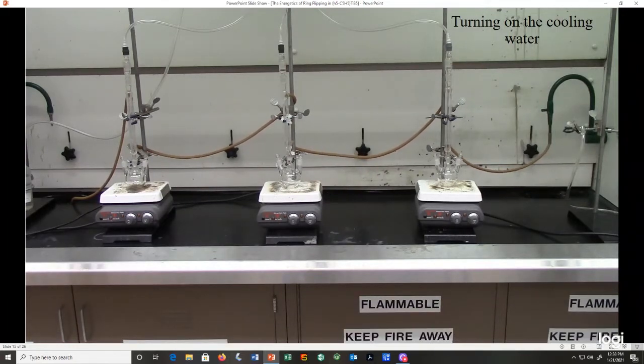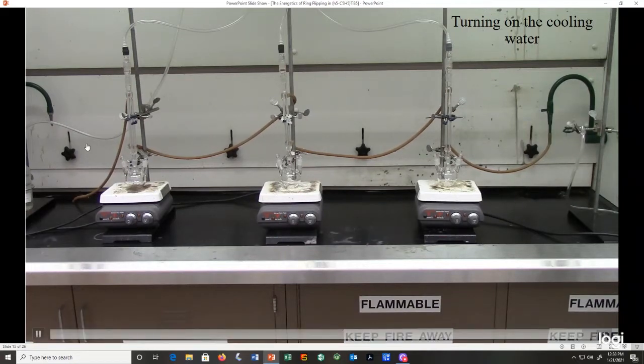You can see as the water is coming on, it's supplying water to all 3 condenser columns, and it's exiting in the little sink over here.